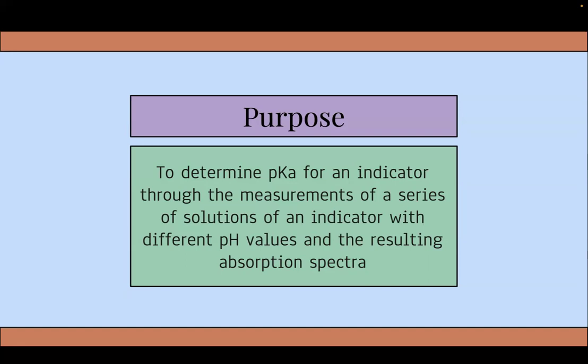Through the analysis of absorption spectra, we can quantify the concentration of each form of the indicator at different pH levels, allowing us to construct a comprehensive understanding of the indicator's behavior in solution. Ultimately, determining the pKa of the indicator provides crucial insights into its acid-base properties, facilitating its application in various analytical and experimental contexts.